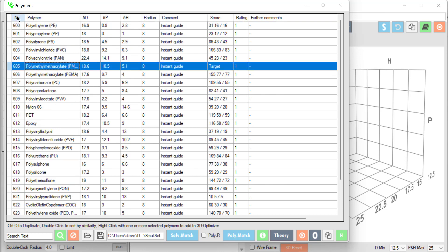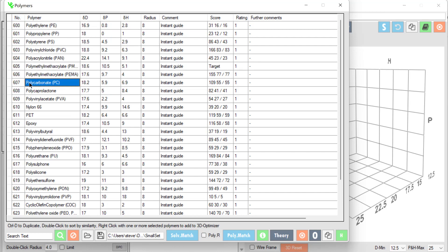Let me re-sort it. And let's say that I want to compatibilize polycarbonate with polyvinyl butyrol. Which solvent would be best for compatibilizing these two polymers? Well let's have a look.